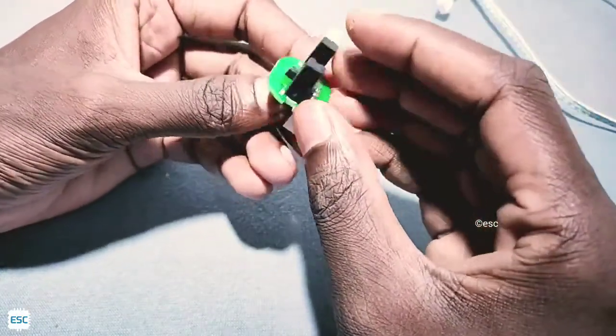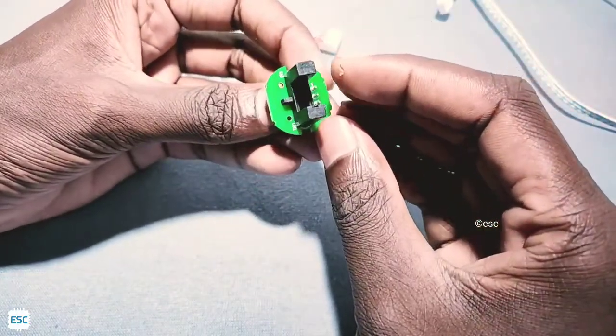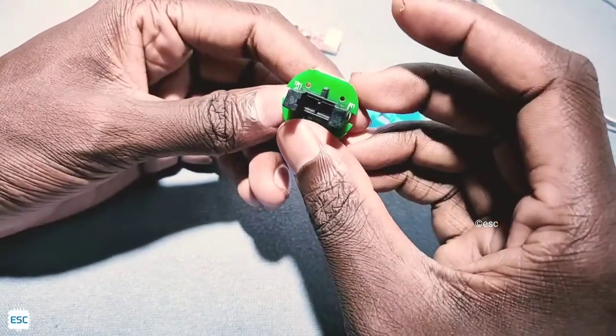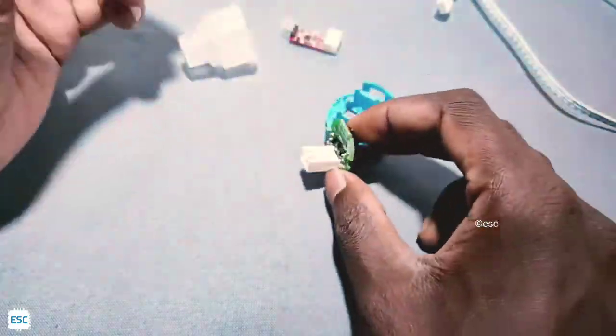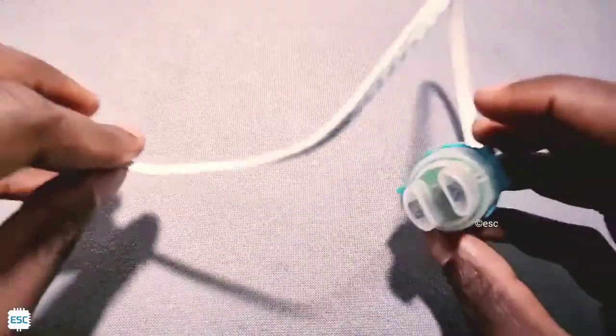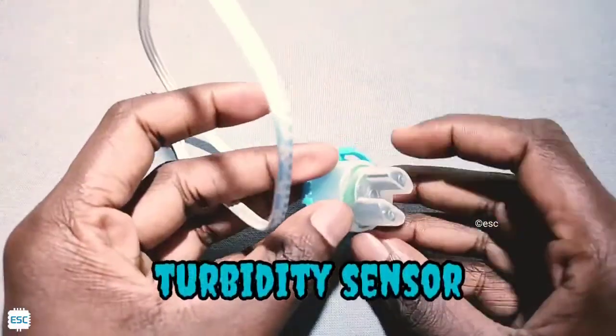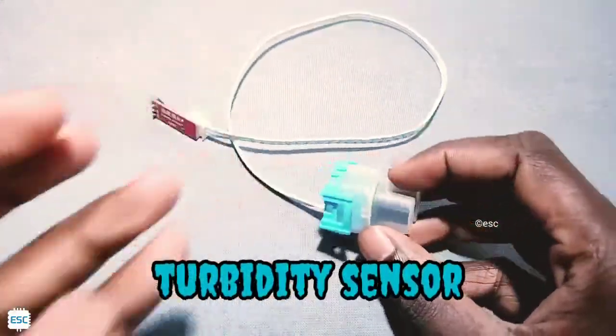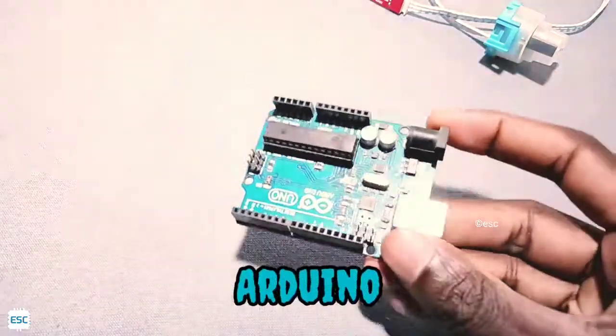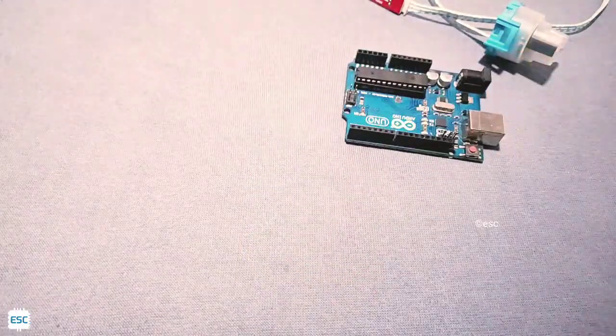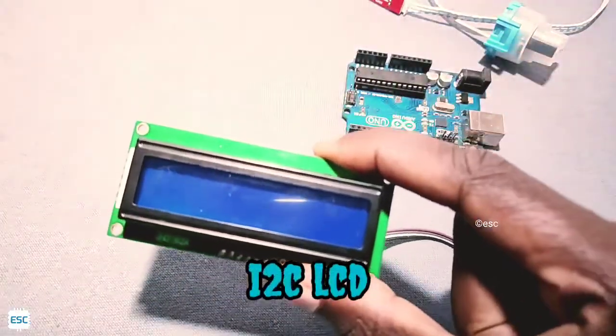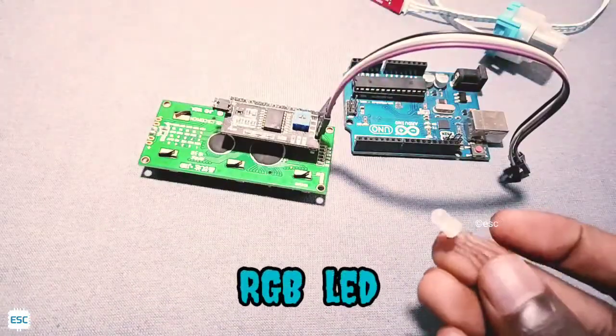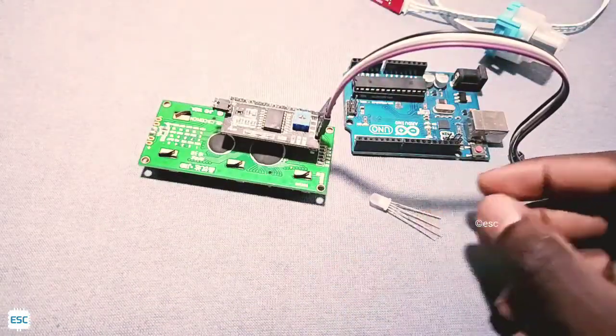Now let's build a turbidity meter using this sensor. For that we need an Arduino, a 16 by 2 LCD display, and an RGB LED.